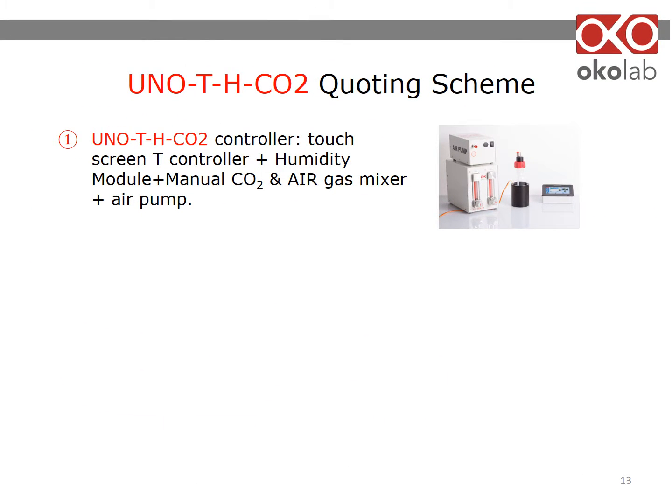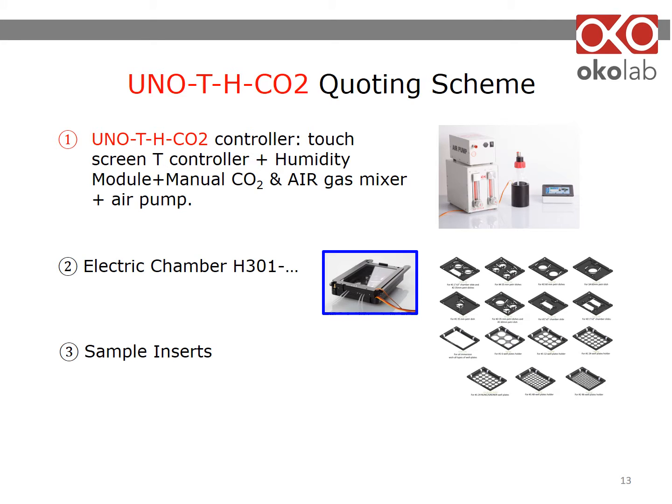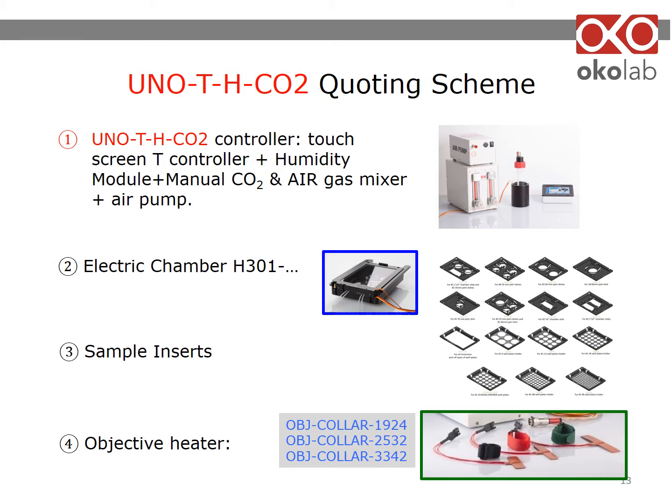If you're using 100% CO2 and air, here is what you need: UNO-T-H-CO2, a stage-top chamber based on your stage brand and model, sample inserts according to your tissue culture vessels, and an objective heater if you're imaging with oil immersion objectives.